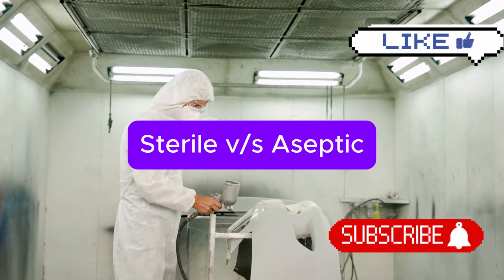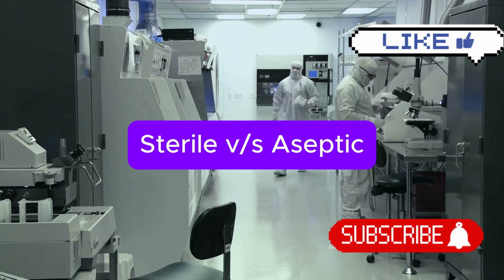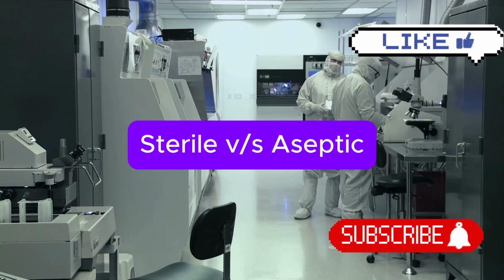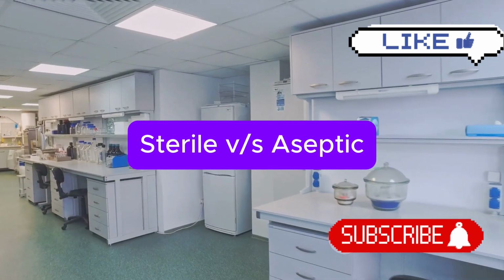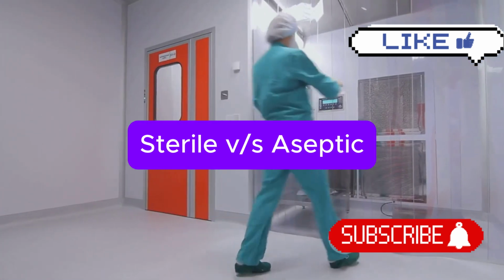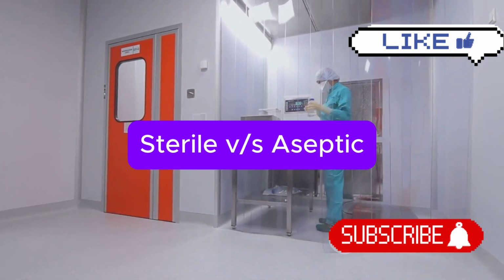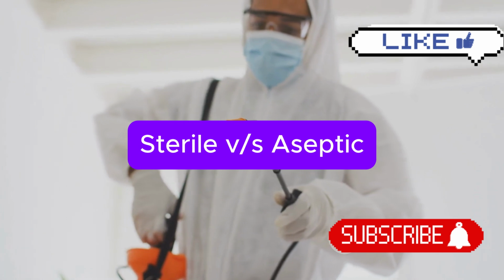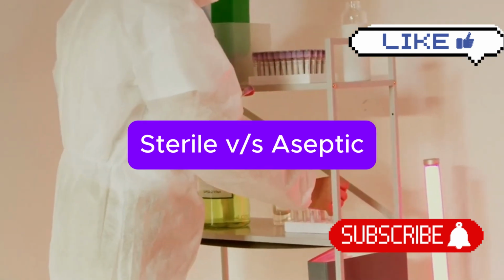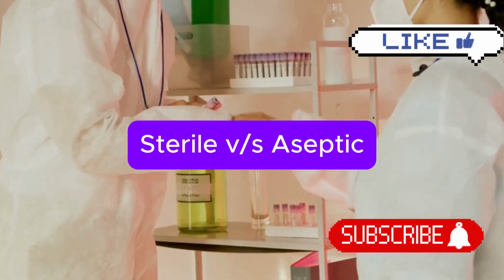Section 7. Maintaining sterility and asepsis, common practices. Maintaining sterility and asepsis in pharmaceutical environments involves a multifaceted approach. It starts with the design of the facilities themselves. Clean rooms, for example, are specifically designed to control airflow, pressure, and temperature to minimize the risk of contamination. Then comes the rigorous cleaning and disinfection protocols. These involve using specialized cleaning agents and methods to eliminate microbes from surfaces and equipment.